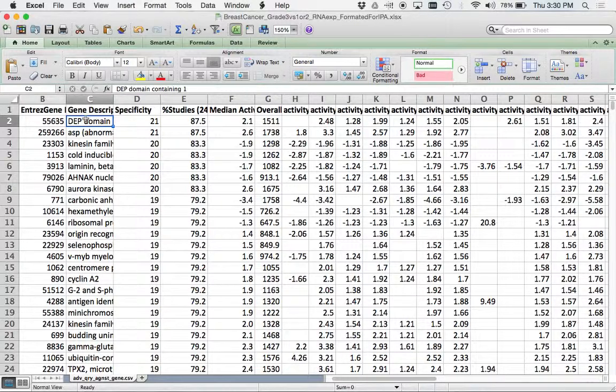In each one of these studies, you can go in and get all the study details. Where do you get it? This is a very important detail when you work on cancer. Totally. You know, if the cells are coming from patients, so not cultured for a long time. At this point, I would say there might be a mix of that, and that's okay. It's just good to know and to be able to exclude the ones that you want to exclude.